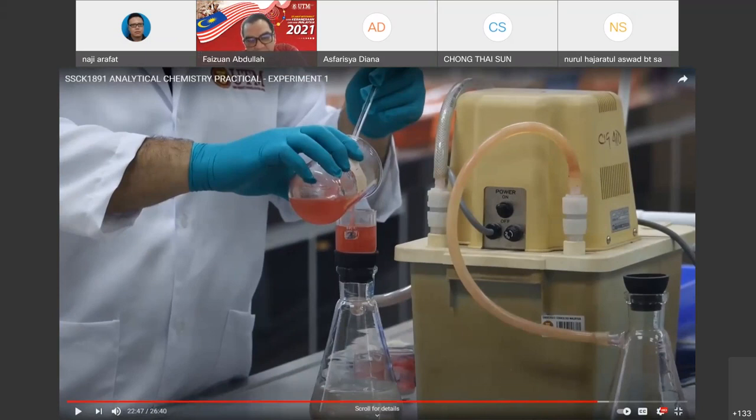After we do the reactions, right, we heat and then we can see the precipitates, right? Why do we need to do the filtration process? Anyone? Obtain the chelate. All right, good.